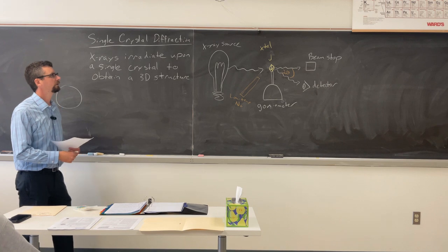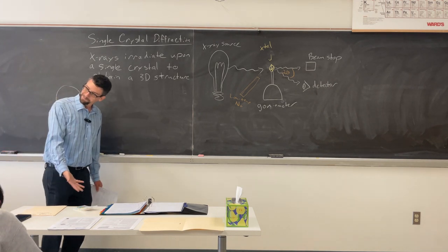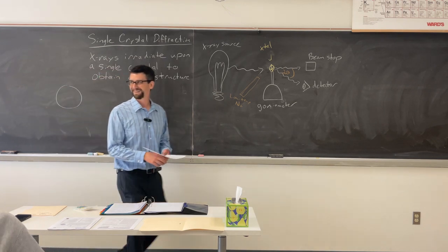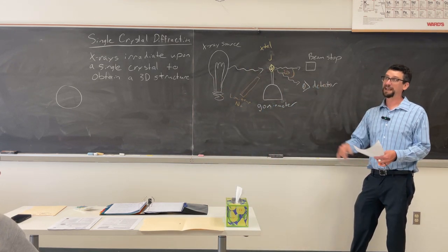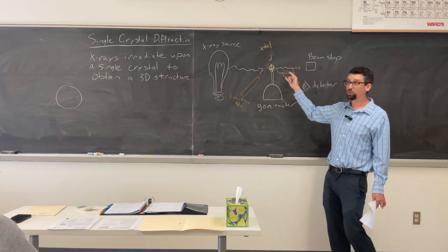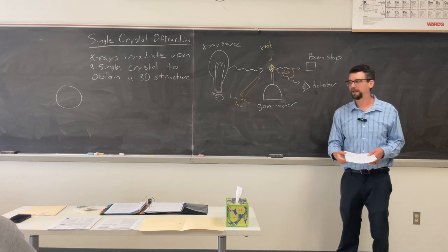So would you want a little mild cooler? The more mild you get, the more thermal problems you'll run into. Why not just have a nice circular jet stream? Yep, that's what happens too. You can do that. So you're trying to cool it down, but inevitably you will heat this thing, and you get some uncertainty that happens.